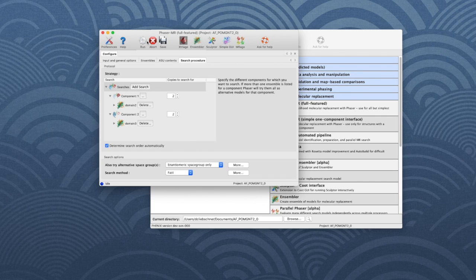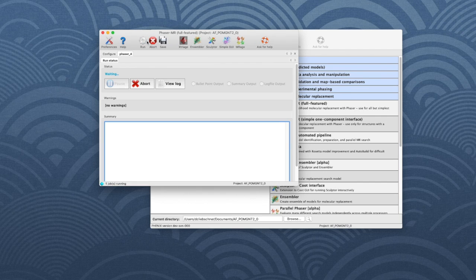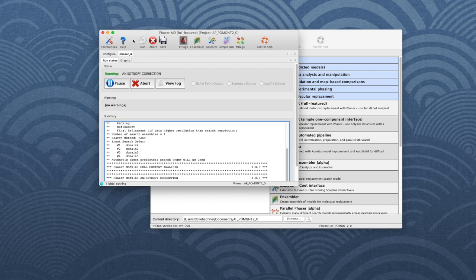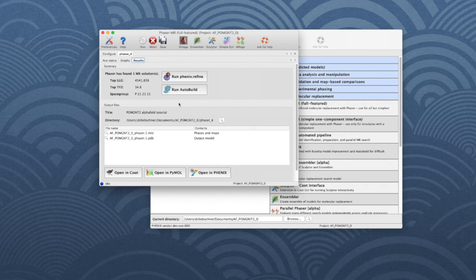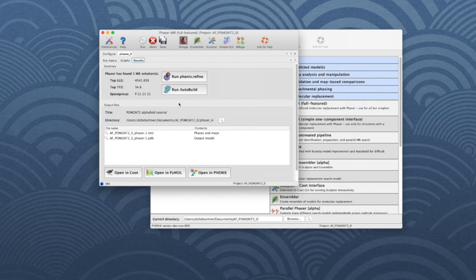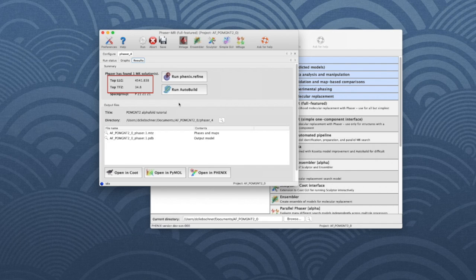The GUI will update the Run Status and Graph tabs. After about 10 minutes, Phaser has found one solution with a very high LLG and TFZ. We can be reasonably confident that this solution is correct.